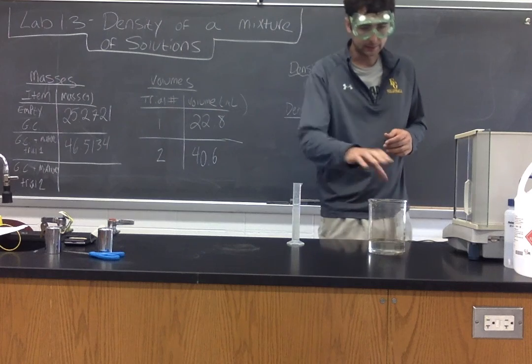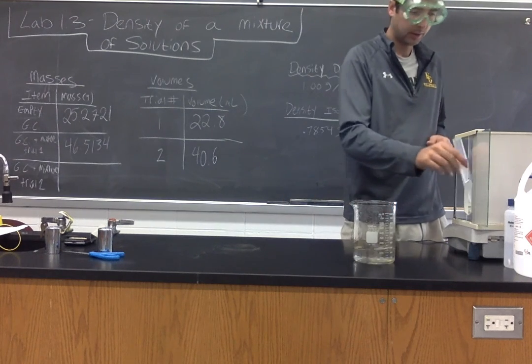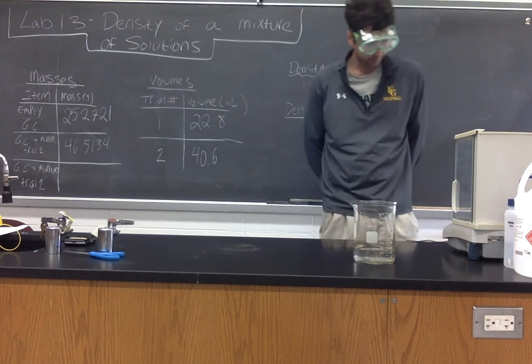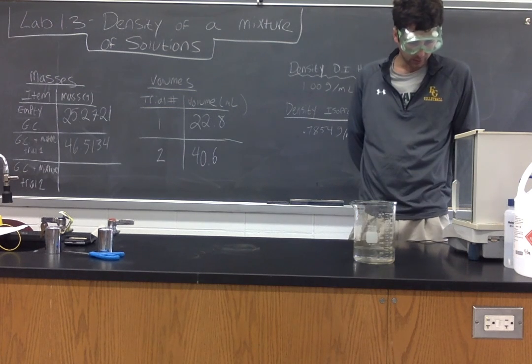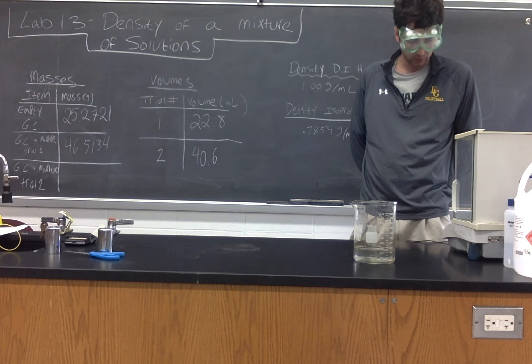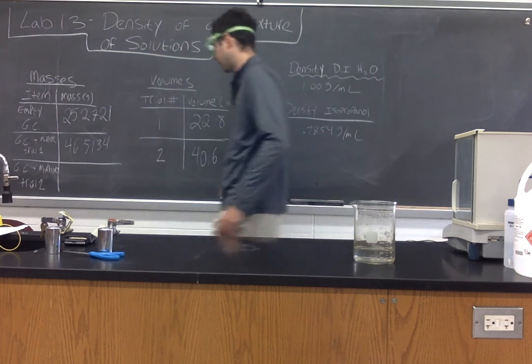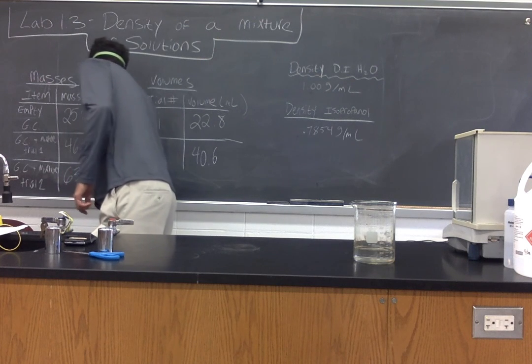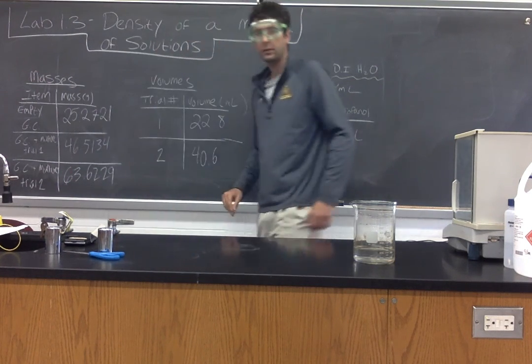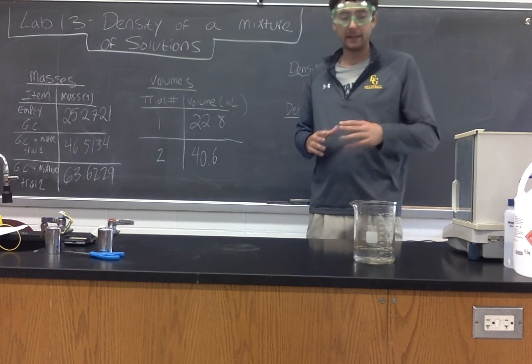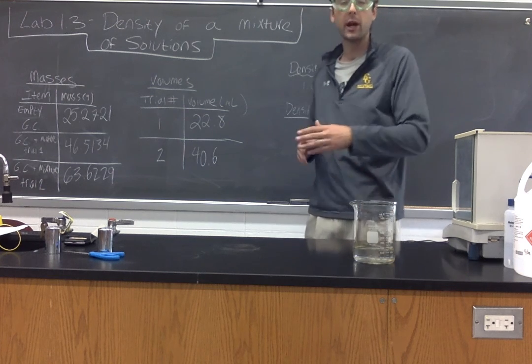Okay, so our second trial, getting down to eye level here, I'm seeing at about 40.6 milliliters. Now let's take our second mass. 63.6229 grams. At this point, ladies and gentlemen, we have enough information to solve for the density of our mixture in both trial one and trial two, as well as to find the percent breakdown of the mixture.